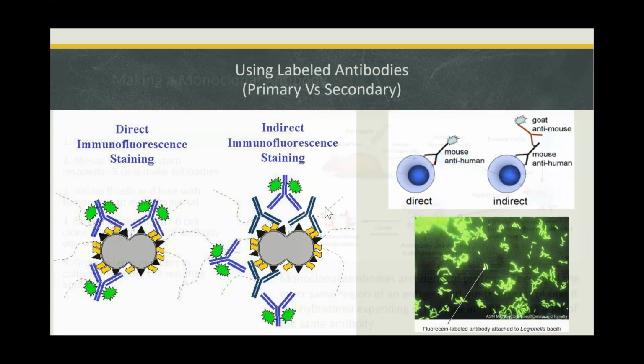This slide is demonstrating how antibodies are used to detect something in the cell. This figure here on the left shows a monoclonal that's been linked, called conjugated, to a green fluorophore. The antibodies bind the protein of interest, and now the cell will glow green. This second image, the middle image, shows that there's a specific antibody bound to the protein on the cell. The antibody is not linked to a fluorophore, so you would not be able to visualize it. This may be a patient antibody. It's not monoclonal. The second antibody is binding the first.